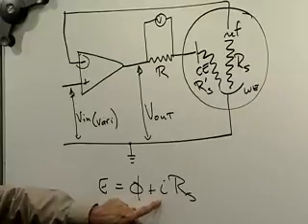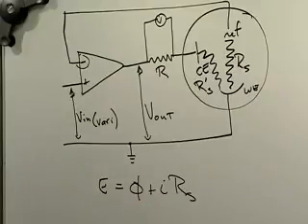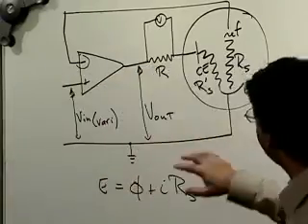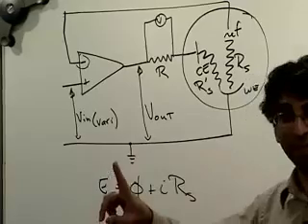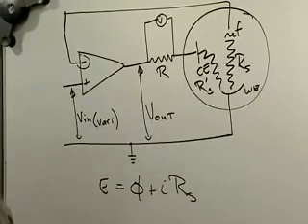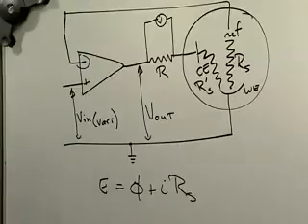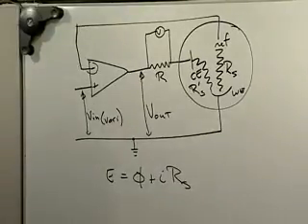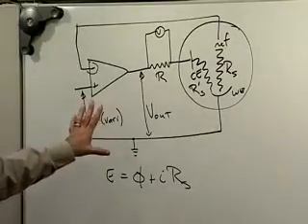But if you're using an analog potentiostat with IR compensation, don't use it. Don't use the IR compensation. The analog potentiostat's wonderful. Another point to make is, if you take the circuit I've drawn here and decide you're going to run back to your lab now and whip out your box of resistors and 741 op amps or whatnot and solder it together to make your own home-built potentiostat, it won't work.